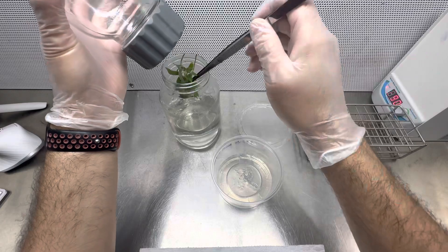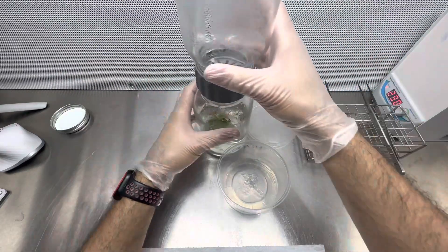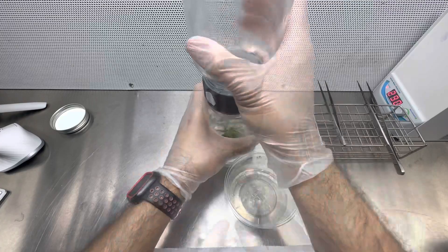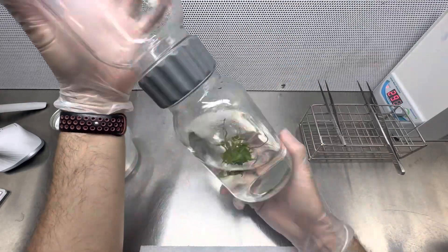All I have to do next is place my label and write the date. I write the date with a sharpie because in the future I may change the media but I'm going to keep the plants in the same jar.